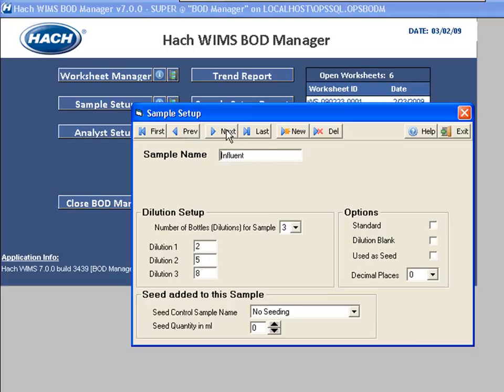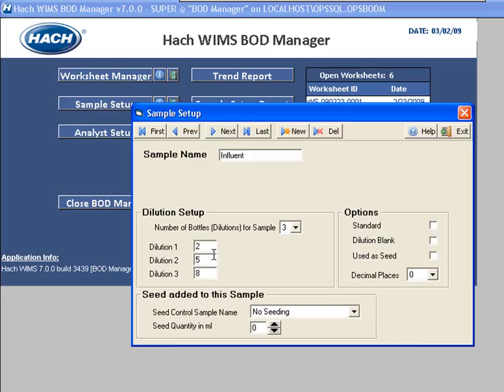I use these buttons here to scroll through the records. Next I'll look at Influent. For Influent, I'm going to run three bottles or dilutions — two, five, and eight are my dilutions. That was suggested by the wizard, but you can adjust those. Anytime you add the Influent sample into a worksheet, it's going to come up and add three bottles at dilutions two, five, and eight.